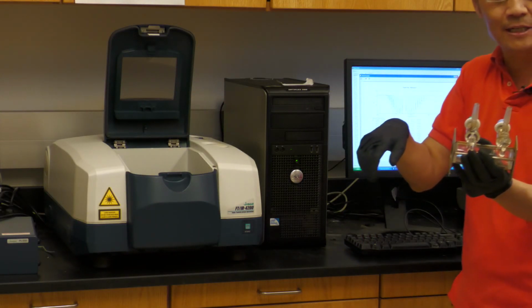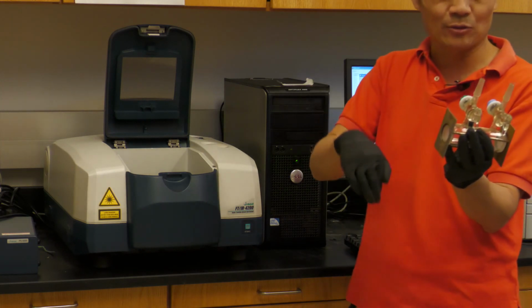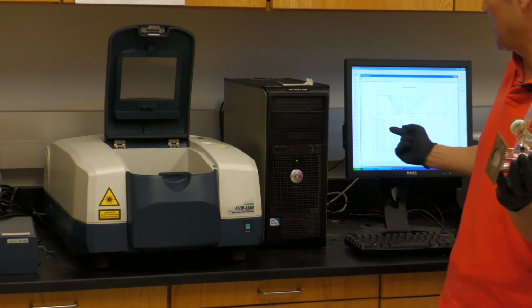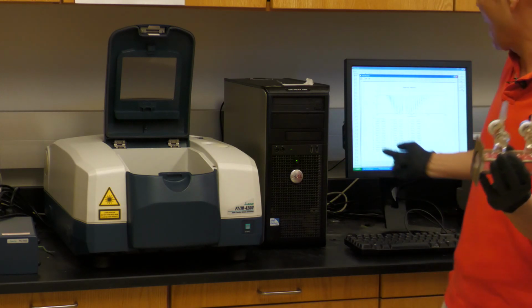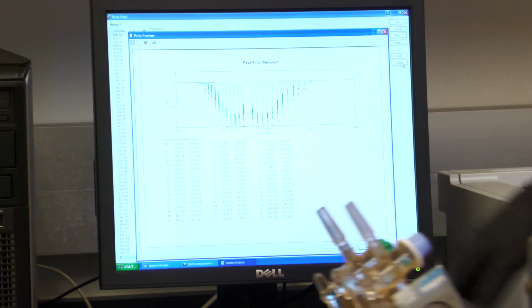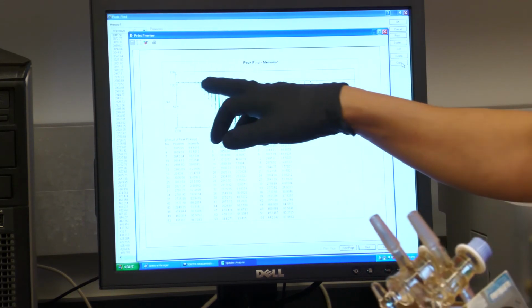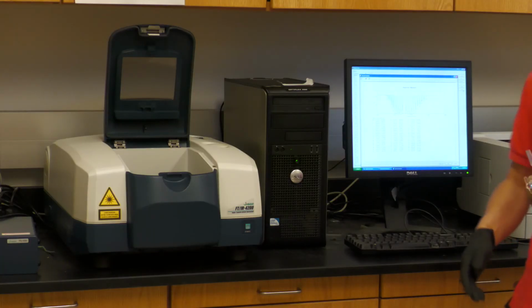Again, you just click the sample. It will measure the DCl. Then send it to data analysis. Then find the peaks exactly the same as this. Then print out the peak number and the peak position. That is this experiment.